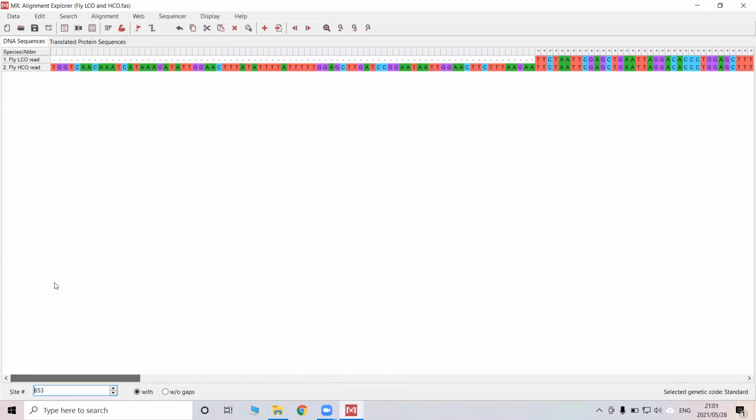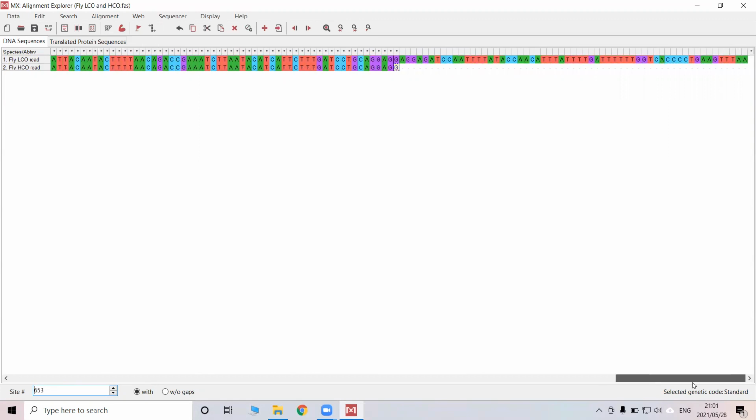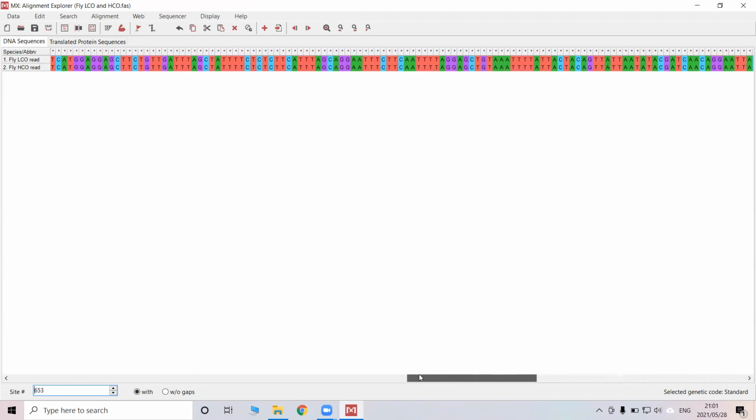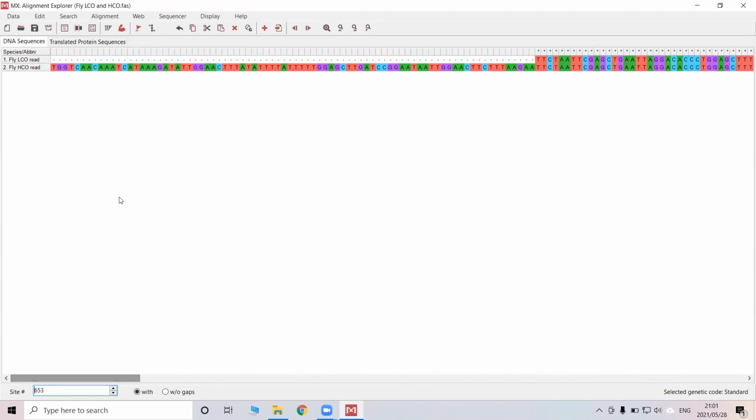And there will also be regions where the reverse sequence or the forward sequence are out of this symmetrical image. We call these the overhangs. These regions where they overhang, many people would argue that because they are overhanging, they are not part of this region where both sequences complement each other, so we cannot rely on them.